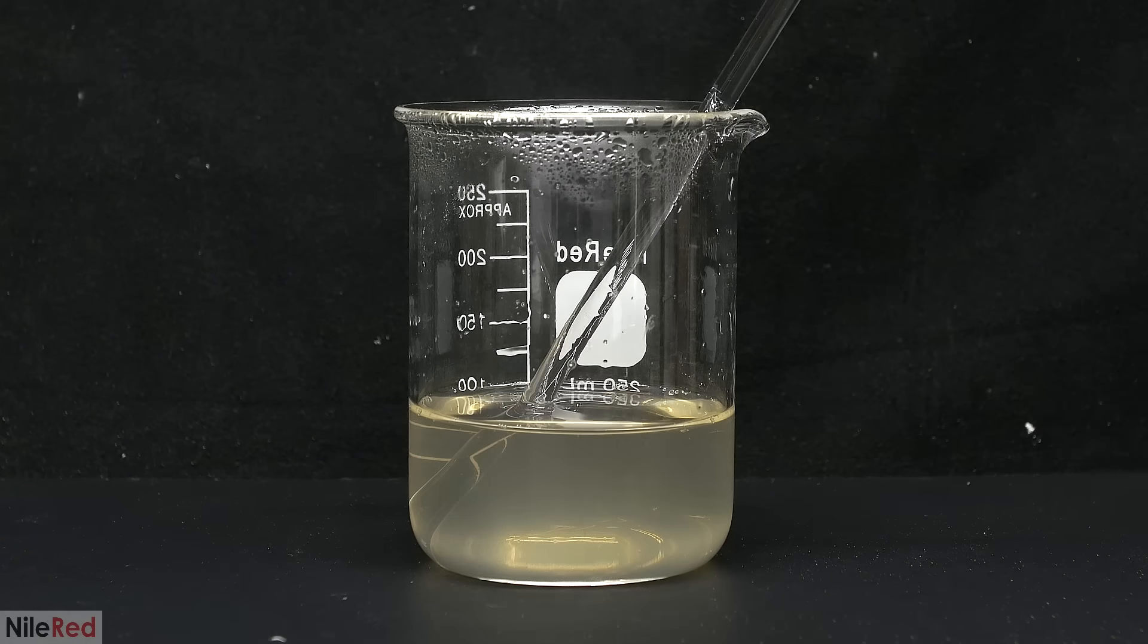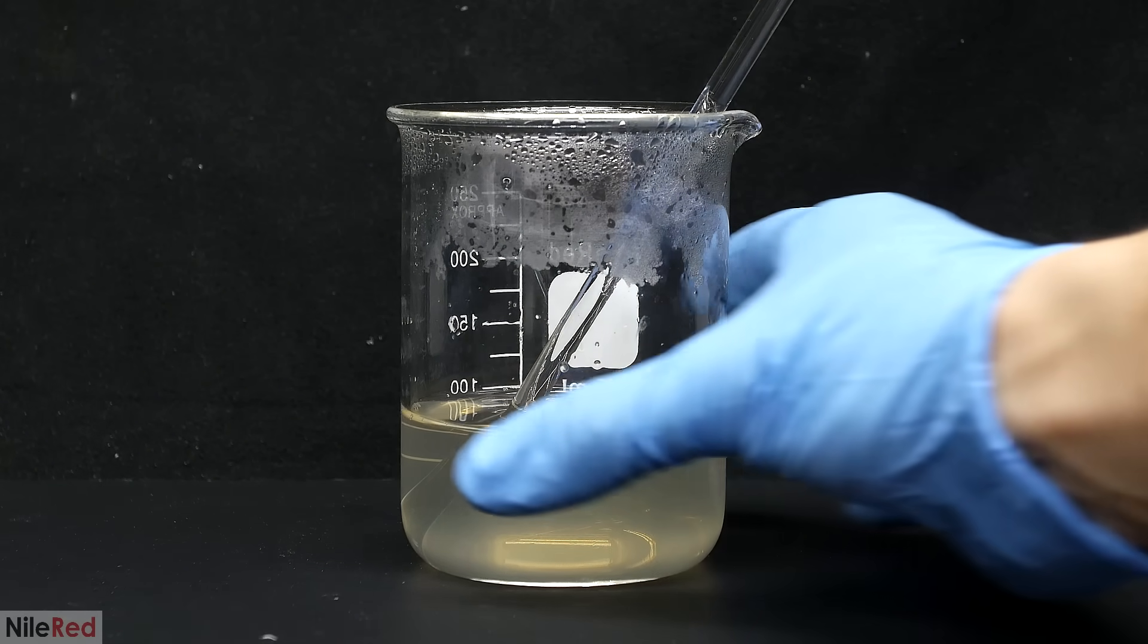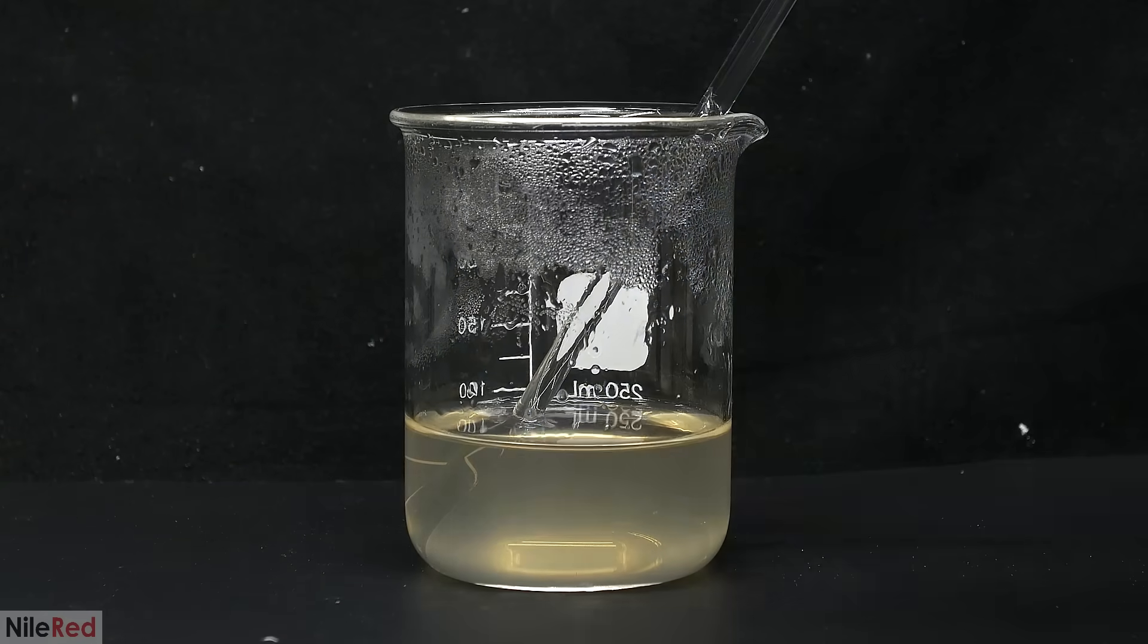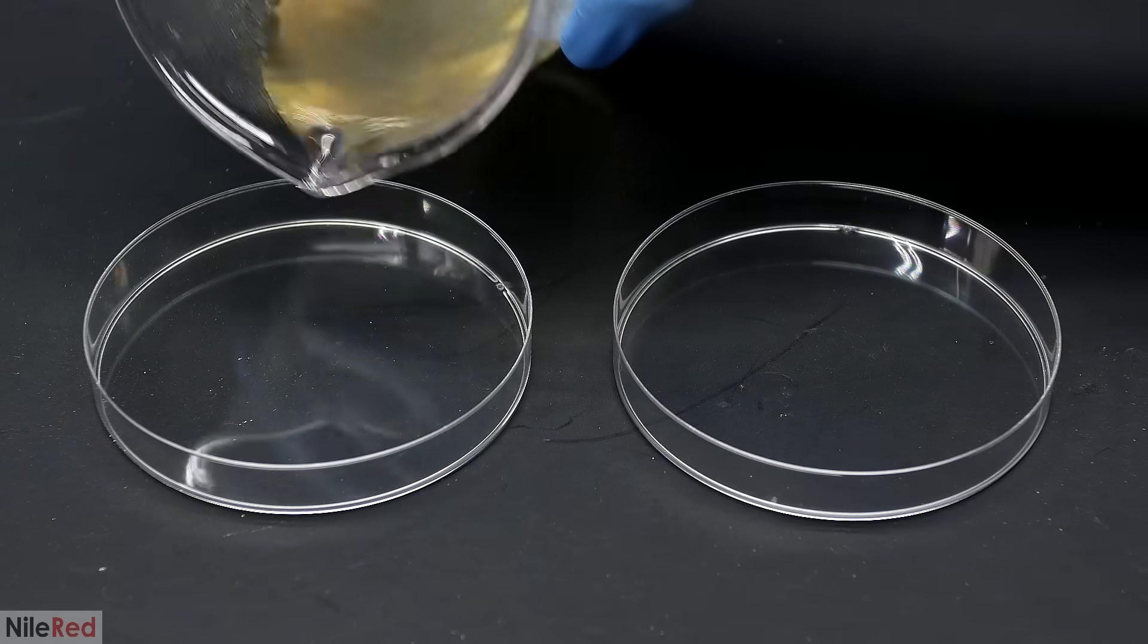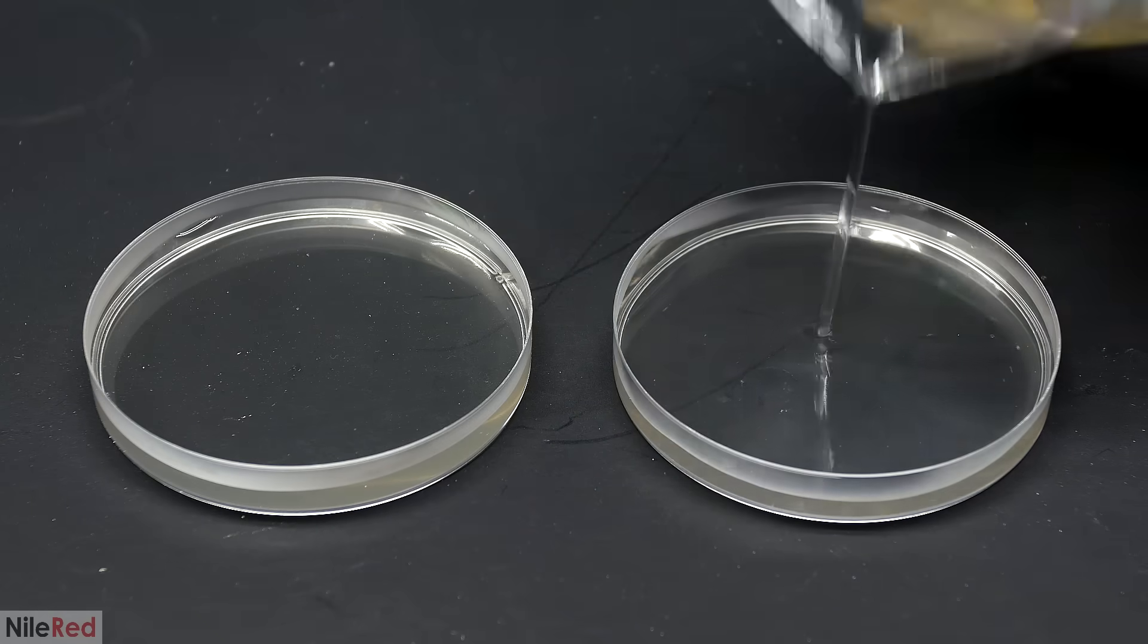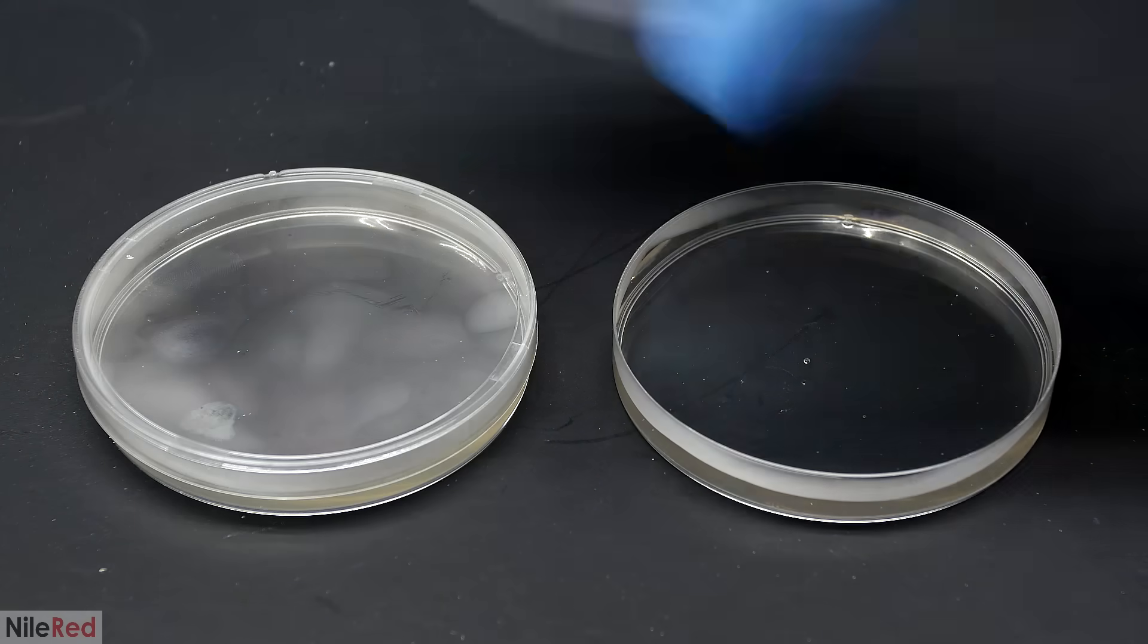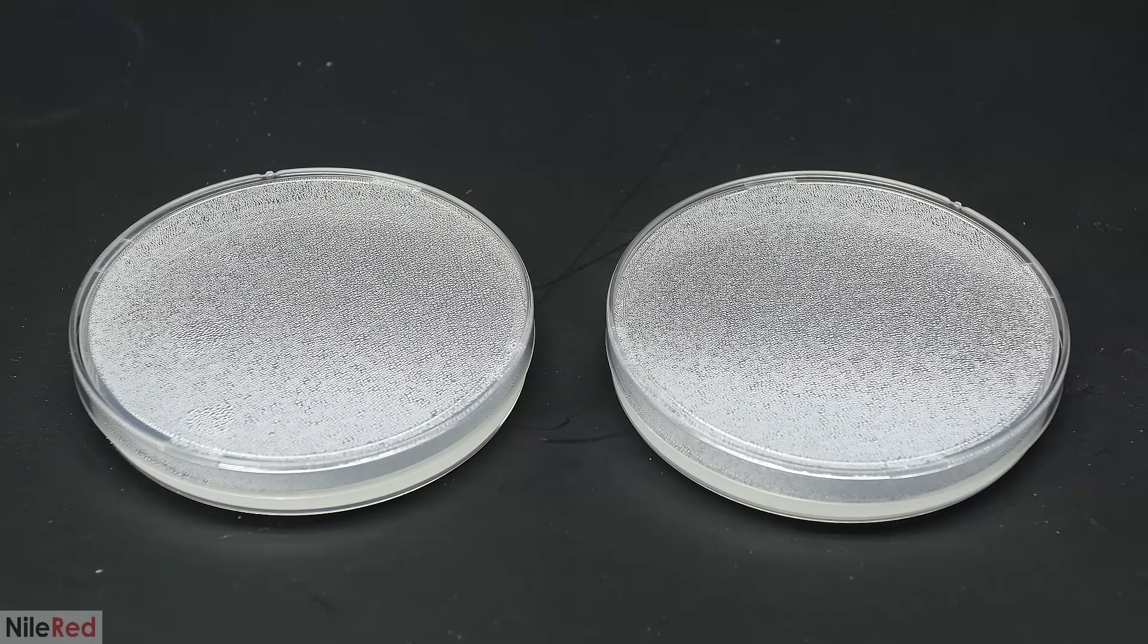All of the agar dissolves, and now we need to wait for it to cool to around 50 or 60°C. We don't need a thermometer or anything for this, and we just need to wait until it stops hurting to touch it. When I reach this point, it's ready to be added to the petri dishes. I fill each dish about halfway and then quickly cover the top. I do this because I don't want any potential contaminants falling in, and I also don't want the water evaporating off. As the plates cool, the agar will slowly solidify.